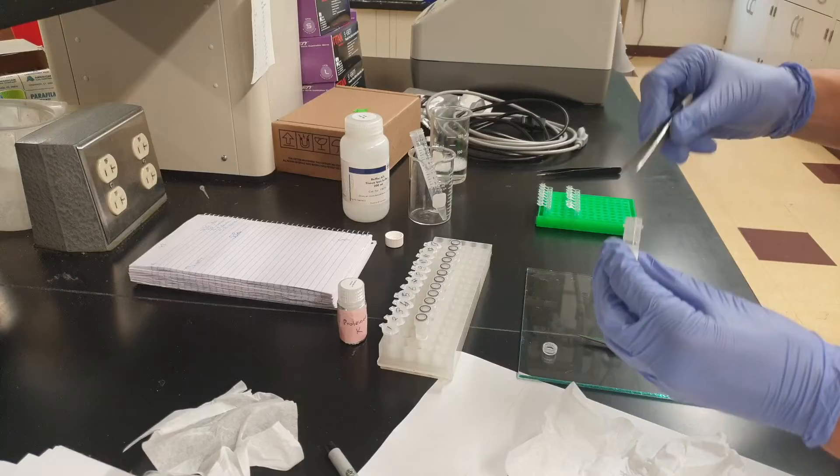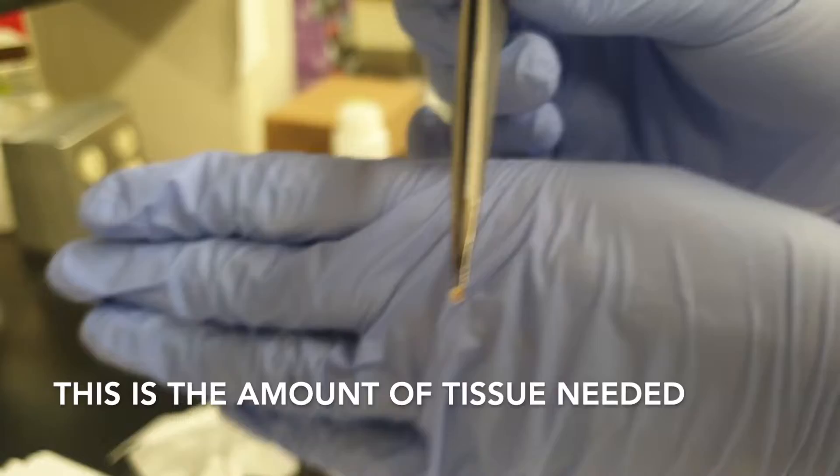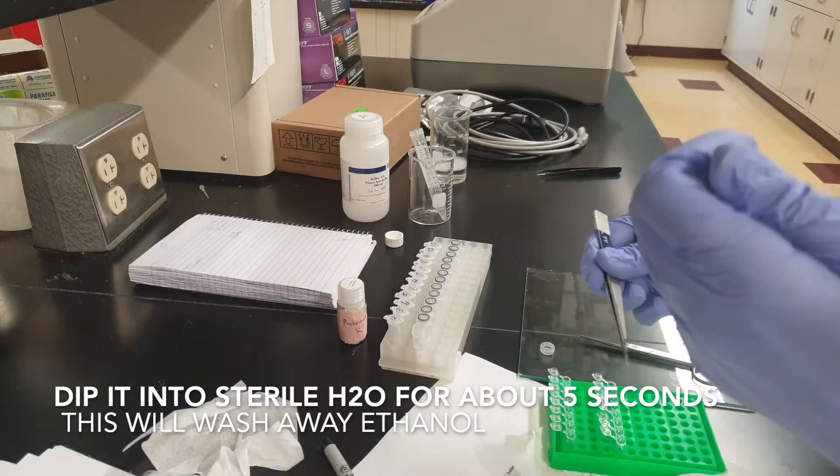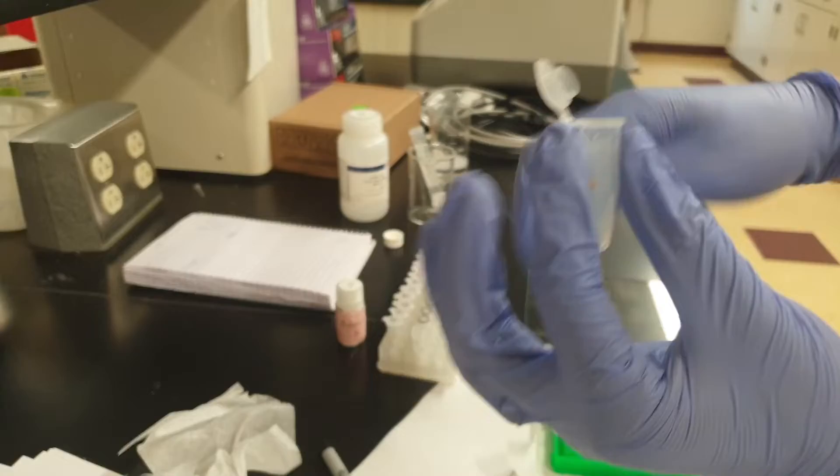Start by dipping your tweezers into ethanol to sterilize them, then grab your tissues. The amount of tissue we're going to use is about the size of half a grain of rice. Then dip it into sterile water for about five seconds; this will wash away ethanol. Then you can put them into the sterile tubes that are already labeled.